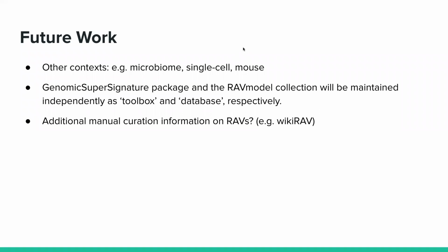That second one is actually interesting, and I don't think we've really thought about how to say above this value it's meaningful. If you calculated the neutrophil RAV on hair, you would still get something, but it doesn't mean that there are neutrophils there.